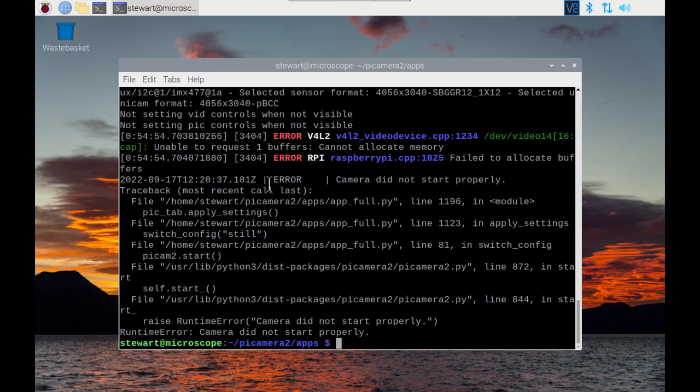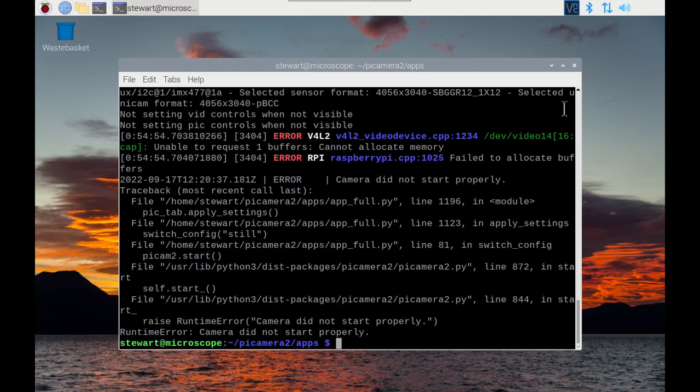This is a problem that I said I'm going to look at - it failed to allocate buffers. The reason isn't because I've already run out memory, but it needs a single allocation of contiguous memory space. So we're going to have a look at how we can fix that.